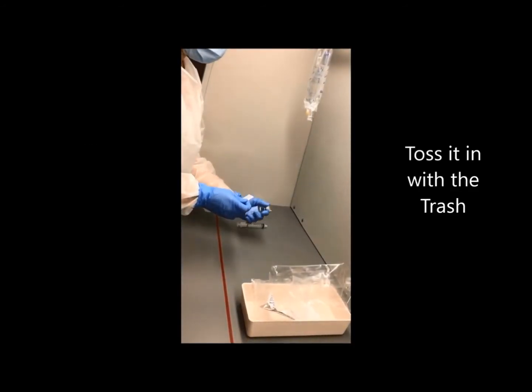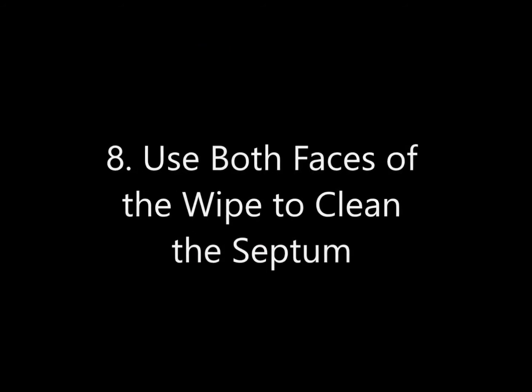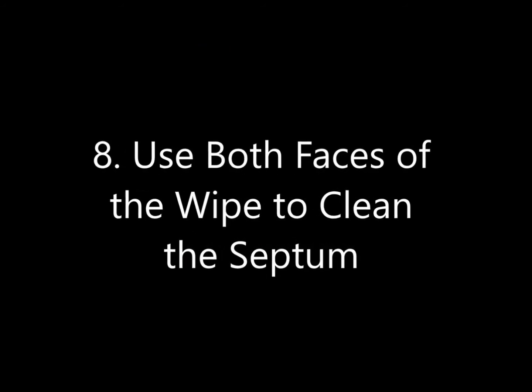Step 7: Pop the top of the sodium chloride vial. Toss it in with the trash. Step 8: Use both faces of the wipe to clean your septum.